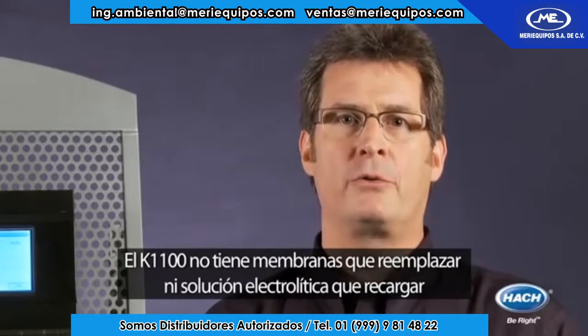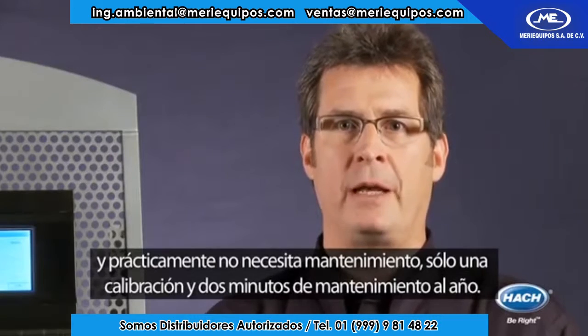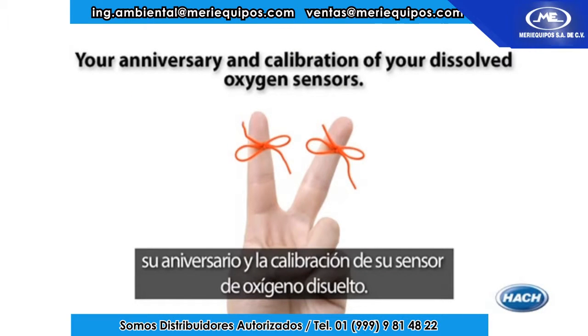The K1100 has no membranes to replace or electrolyte solution to replenish, and is virtually maintenance free — requiring only two minutes of maintenance and one calibration every year. In fact, there are only two dates you need to remember once a year: your anniversary and the calibration of your dissolved oxygen sensor.